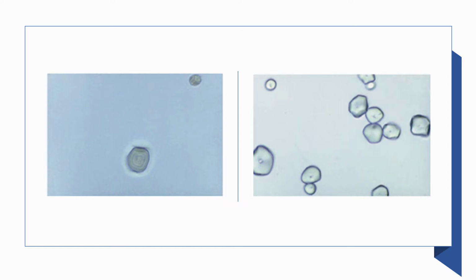So here are some examples of artifacts. On the left is a rounded structure with concentric circles representing a pollen grain. On the right, you see highly refractile spheres with a dimpled center representing starch granules, which are coming from the cornstarch or cornstarch powder used in powdered gloves that may be used by the laboratory personnel doing the microscopic examination. They can resemble fat droplets, or they can also be confused with red blood cells.